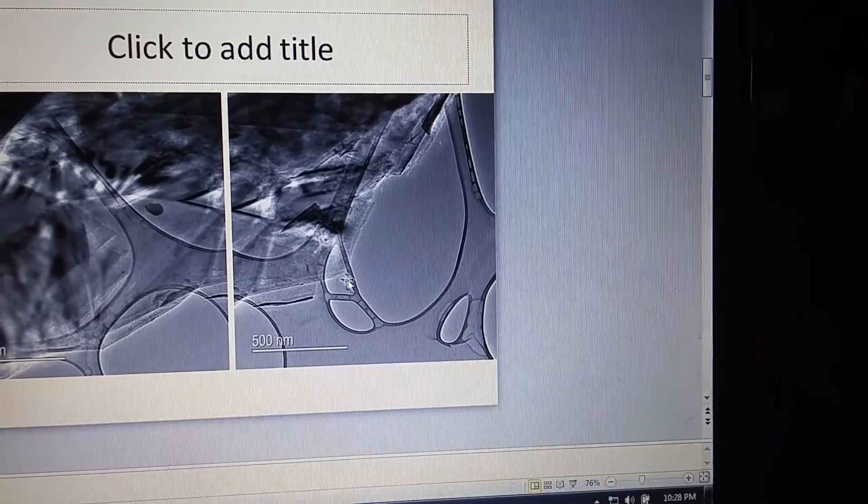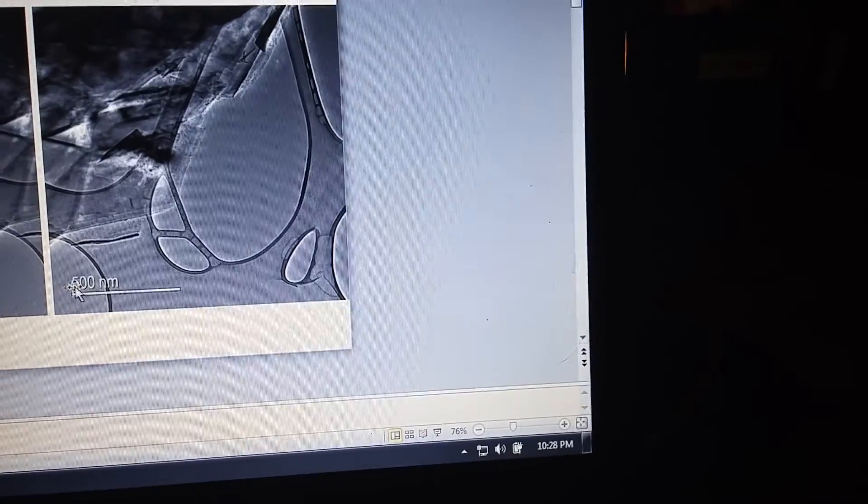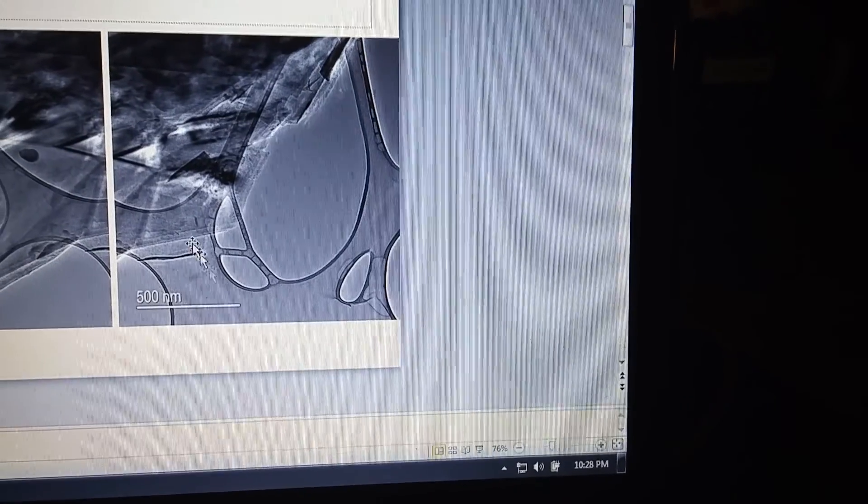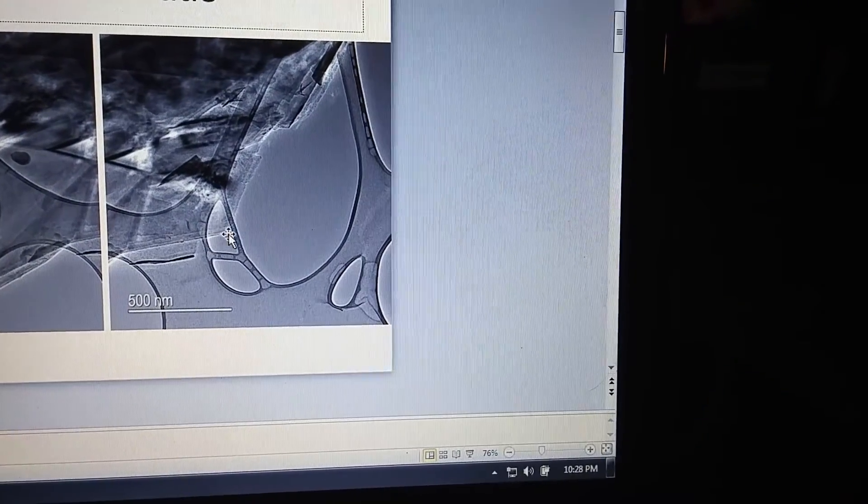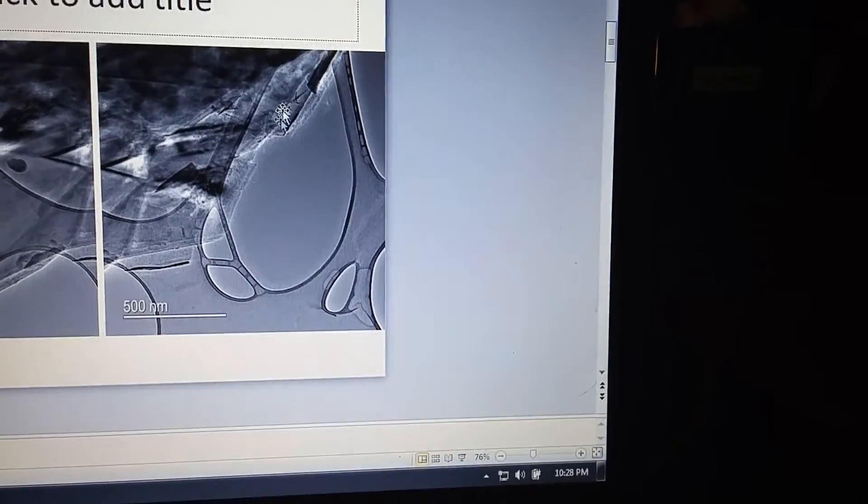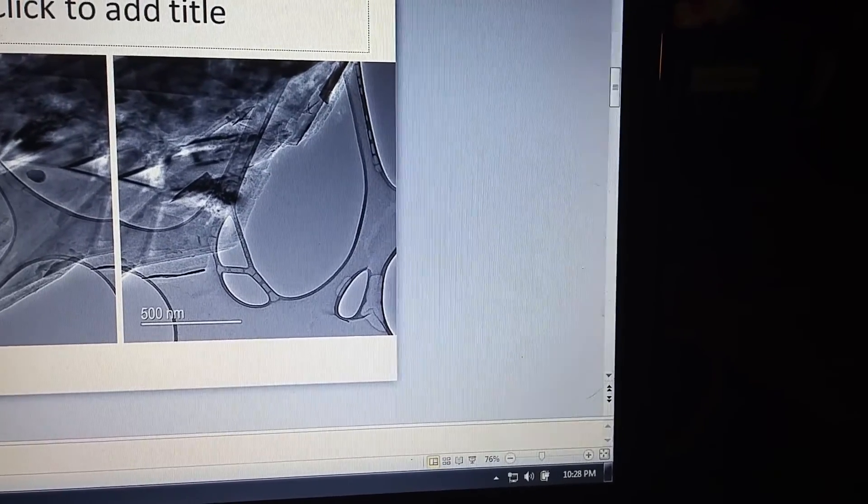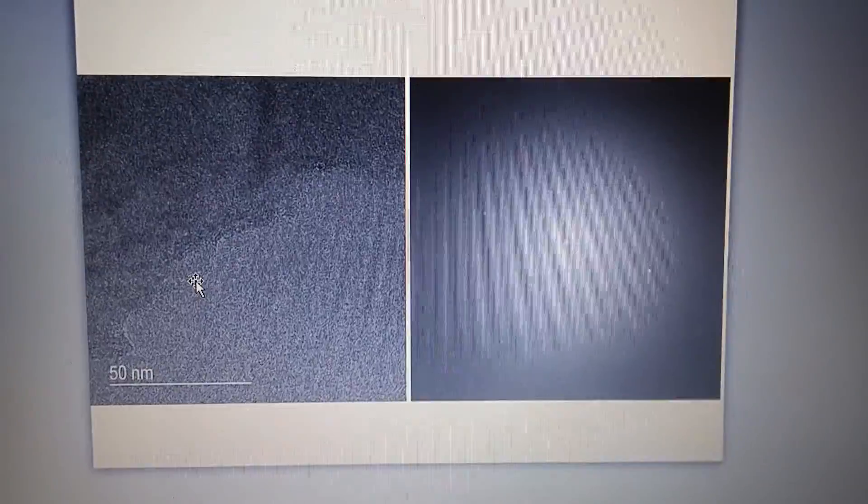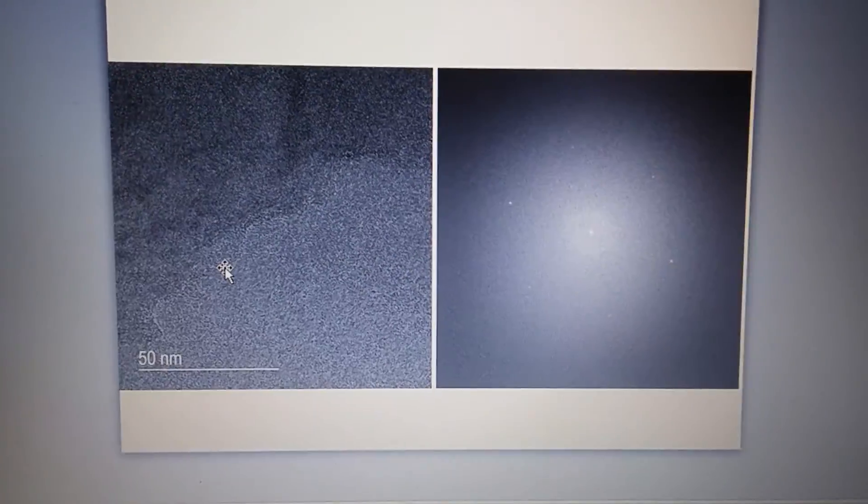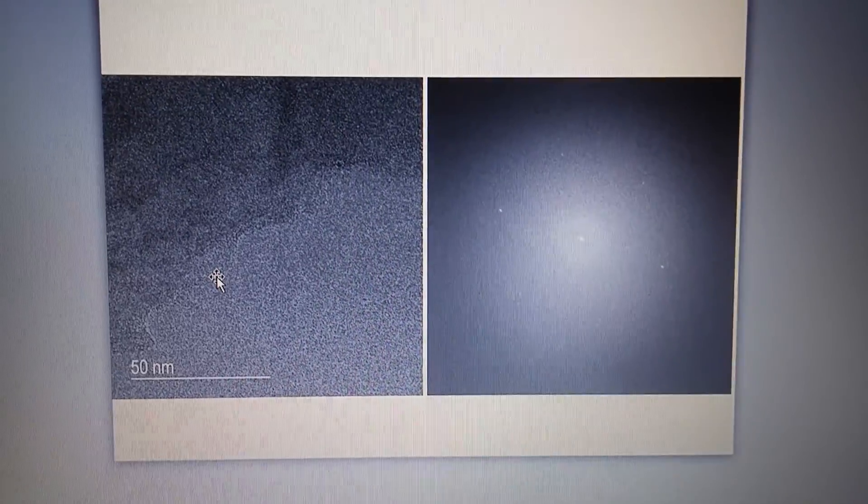And then here you go. Here's closer edge, and if you can see, that's 500 nanometers, which is very small. And you can see how the edge of the flakes are, you know, right there. And then this is 50 nanometers, and now you're looking at atoms. And that's the edge. You can barely see it. It's actually on the phone, hilarious enough, that I'm looking at in the video that you're seeing. It has a better contrast between the edges.